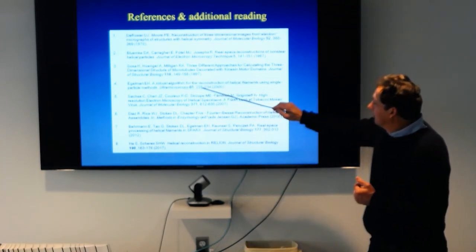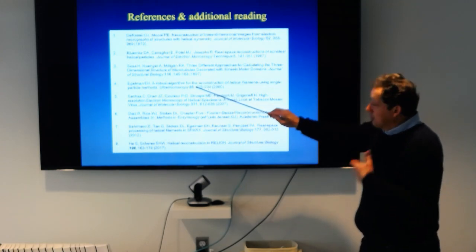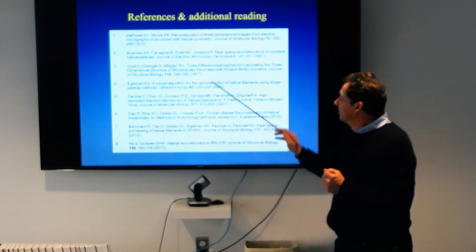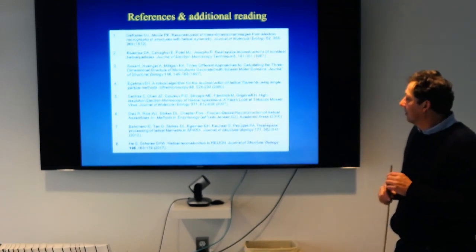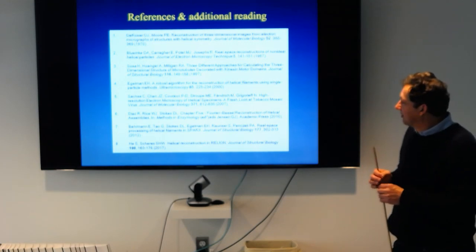Egelman, most people use some form of it, and actually we have one part in our algorithm that uses routines from the Egelman reconstruction algorithms to refine the helical parameters.